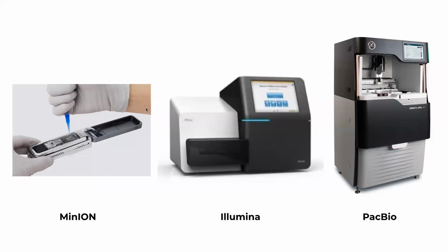Both MinION and PacBio produce long reads. However, the quality of those long reads is going to be lower. So the reliability of each individual nucleotide is going to be lower because we gain in length. However, if we are looking to assemble full genomes, the longer the read, of course, that's going to be easier to assemble. We have less pieces to assemble together. They are longer, so we can more easily combine them together.